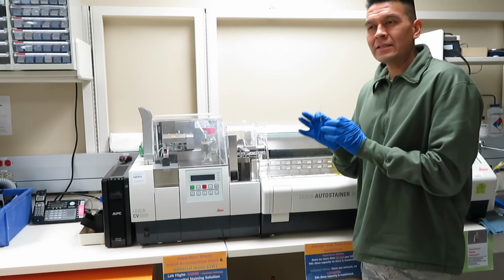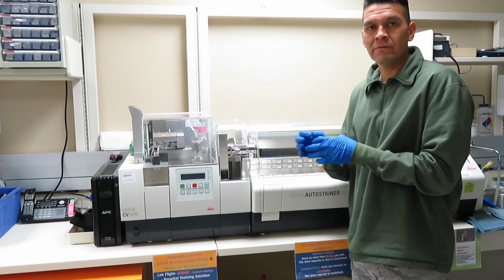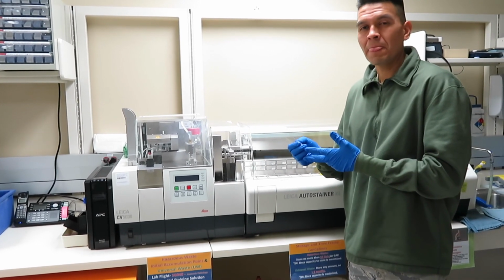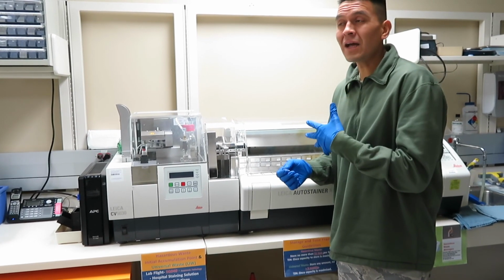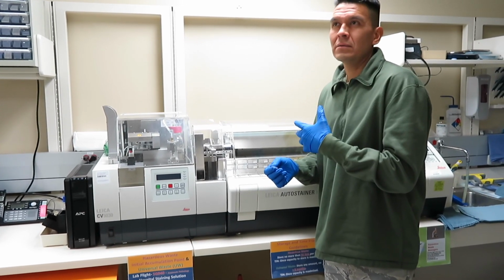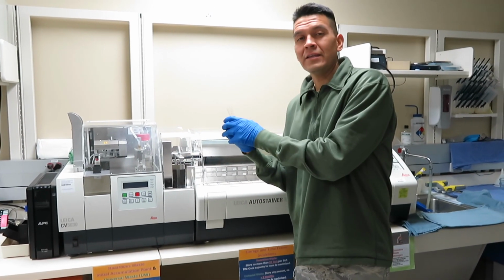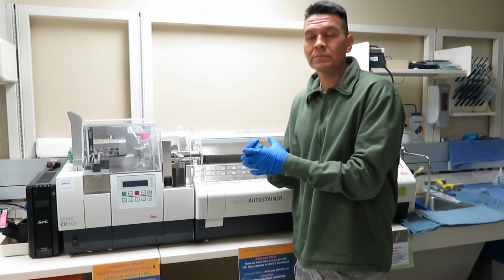And how they stain the tissue is depending on the charge of the cellular structure. So in general, the nucleus has a negative charge and the cytoplasm has a positive charge. And what happens is the hematoxylin is more of a positive charge stain, and so that hematoxylin will stain to the negative nucleus, so it will become more blue and darker.